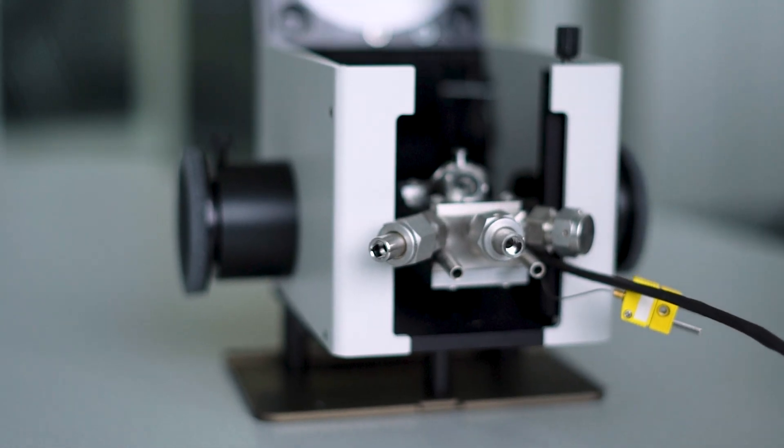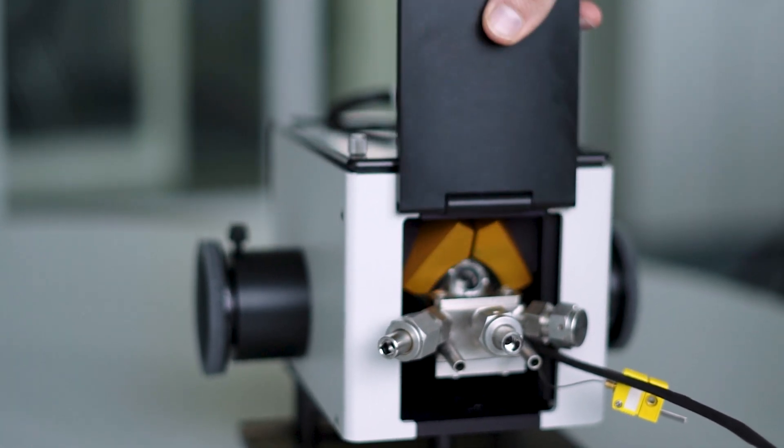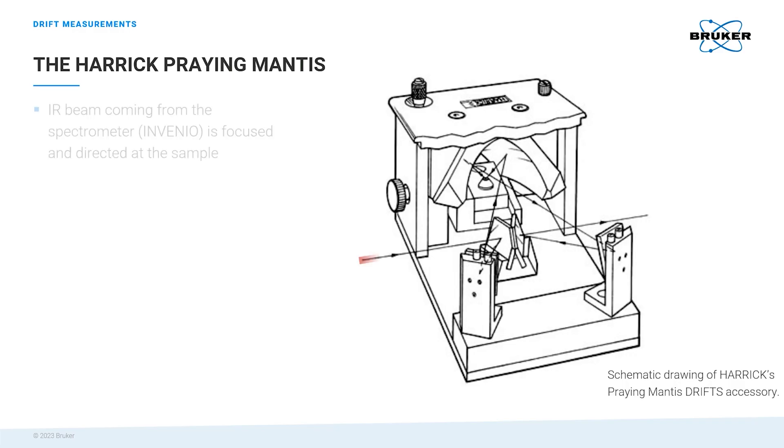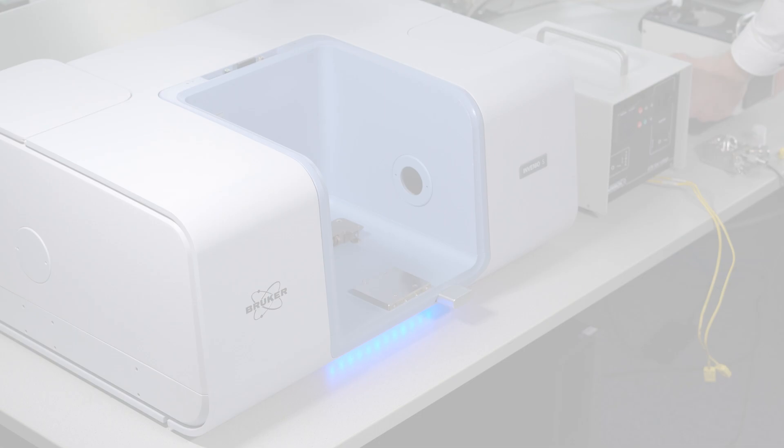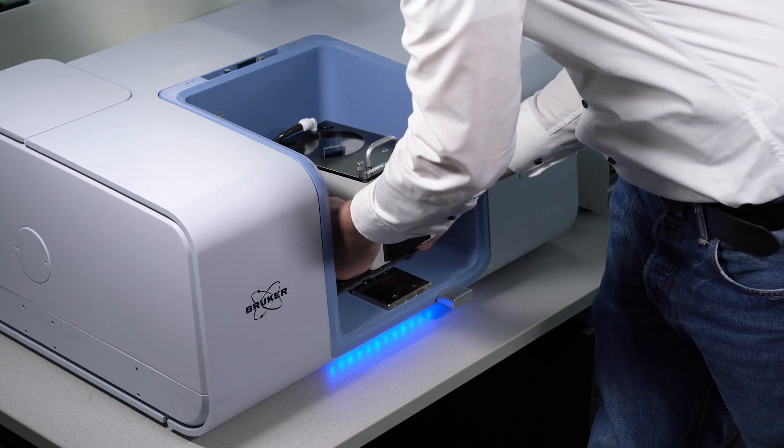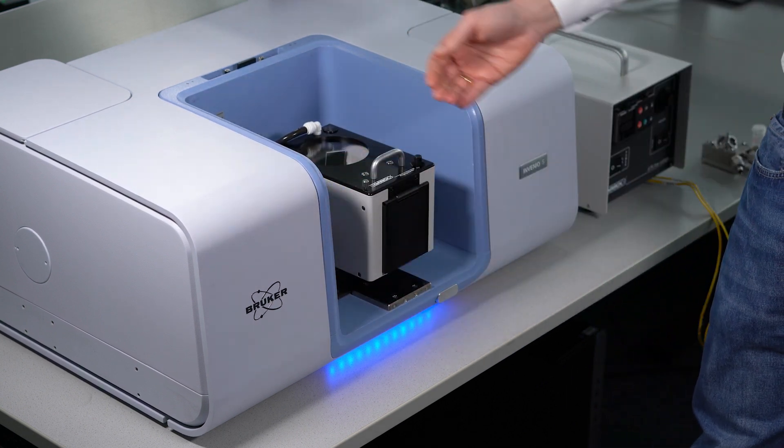The accessory we use for our DRIFTS measurement is the Praying Mantis from Harrick. It focuses the incident beam coming from the spectrometer onto the sample, collects the diffusely reflected light containing the chemical information and guides it back to the Invenio. Let me get the accessory and put it into the spectrometer. This big window on the top can be used for observation.